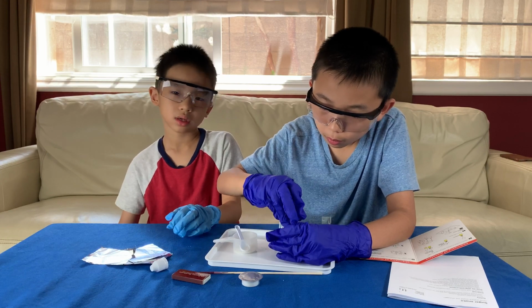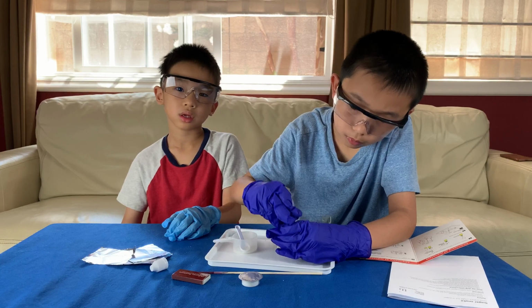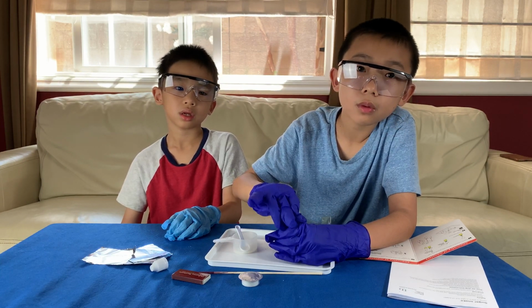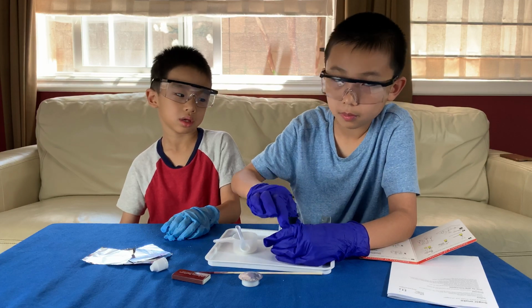So when you shake, hold on to the bottle and just shake the funnel. Because if you shake the actual bottle, I don't know if it'll trigger some kind of chemical reaction. Okay? Well, we're gonna have to shake it later, but maybe you don't shake it till later.